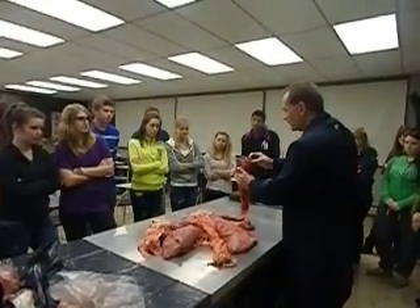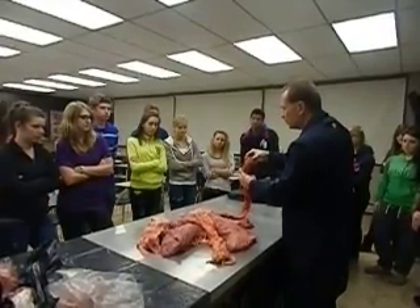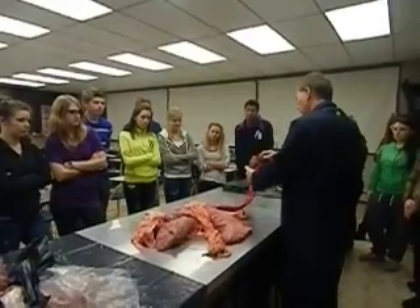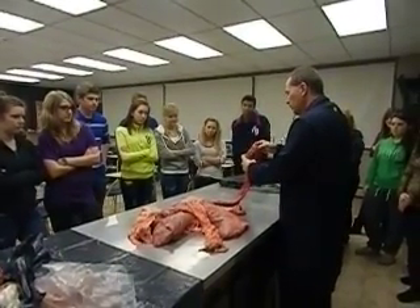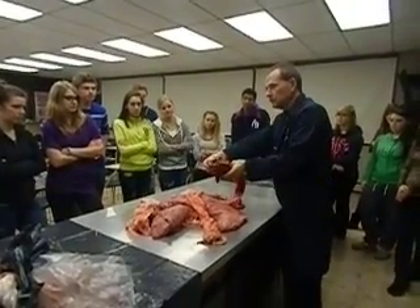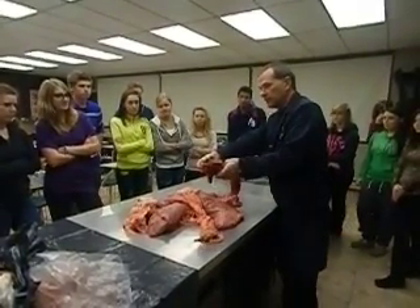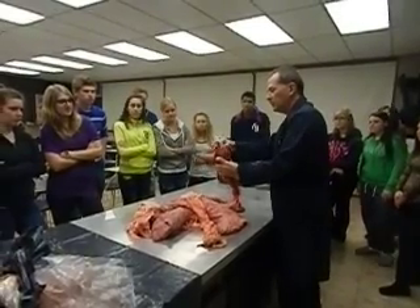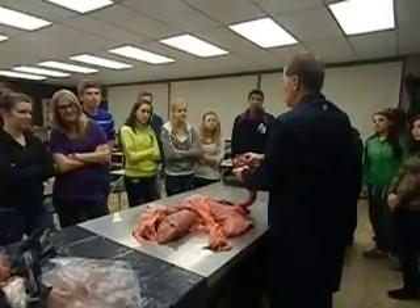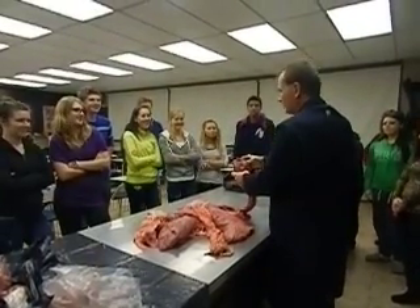If you actually go back here, the reason I asked for this thing to be so long — I wanted you guys to see the vocal cords in the cow itself. Remember I was telling you about the vocal cords being two strings? That's actually them right there, where the sound is being generated. These two guys right here — those two guys. So the cow can go moo, or moo, whatever it is.